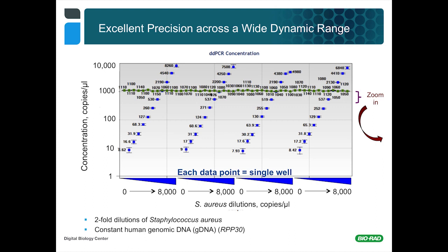The blue represent markers for the FAM channel, which is where the Staph aureus is being measured, and you can see as you go up each of these 4 replicate series here, a single data point for each one of those, a single ddPCR for each of those blue dots. You can see that there's a very, very regular doubling of the counts for a doubling of the concentration.